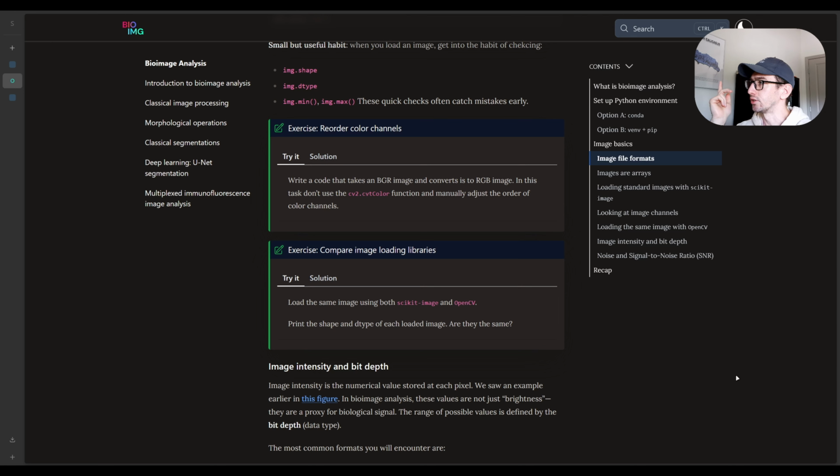So now we can try to use it inside our program to reorder the original image, because NumPy uses the same ideas of slicing behind that. It's just one of the possible solutions. You can definitely use a lot of different things, but this one is probably the shortest one that can be used.